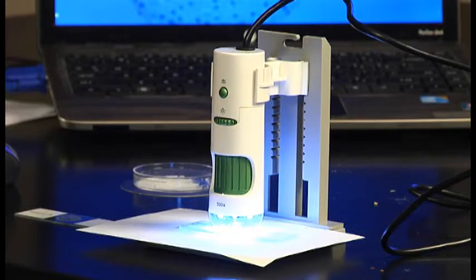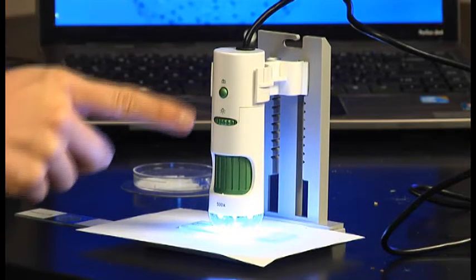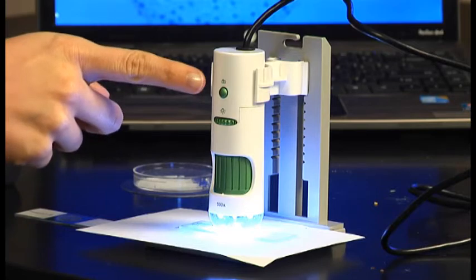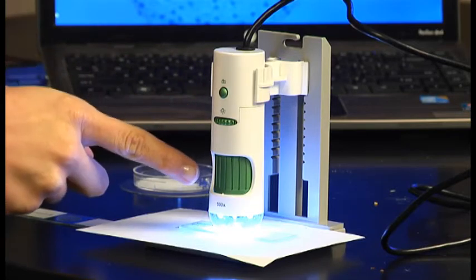The SmartScope 500 is extremely easy to use. You have three controls all on the front. You have the camera, the light dial, and the focus dial.